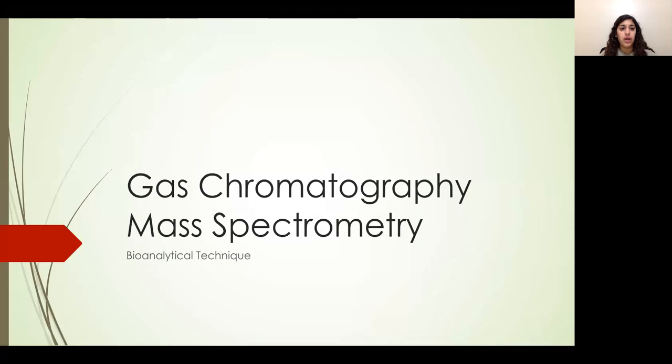This video is on the bioanalytical technique gas chromatography mass spectrometry.